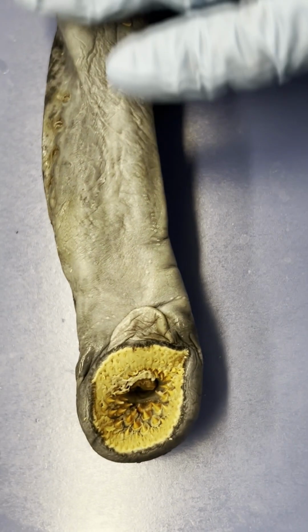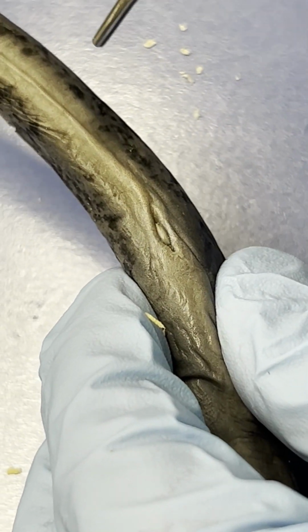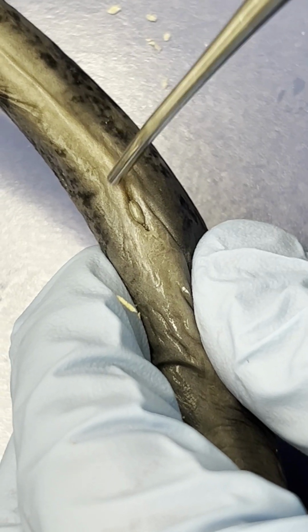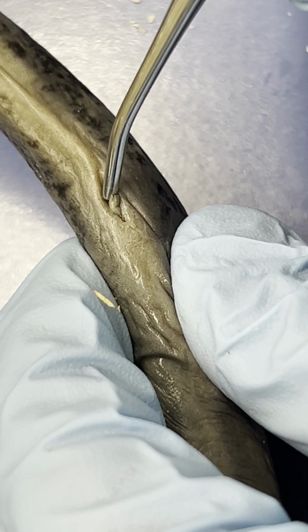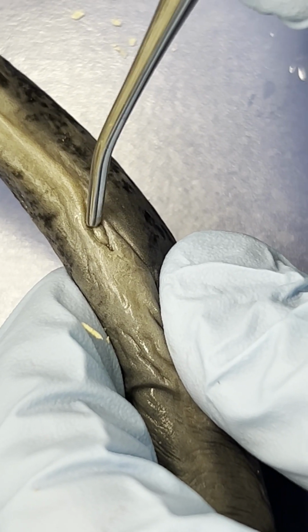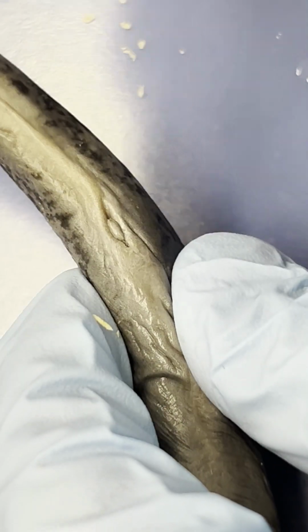If we stay ventral under the animal, let's go towards this opening towards the tail. You guys should be familiar with this, that it is a cloaca. Cloaca, all-purpose chute. So you should know what material is going to come out of this cloaca for this animal. But there's also this structure right here, this microstructure I'm lifting up. This is the urogenital papillae. So make sure you also look up the function of the urogenital papillae. That's a lot of the external structure that we're actually going to talk about in this video.